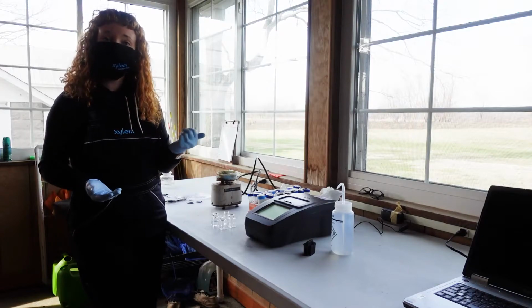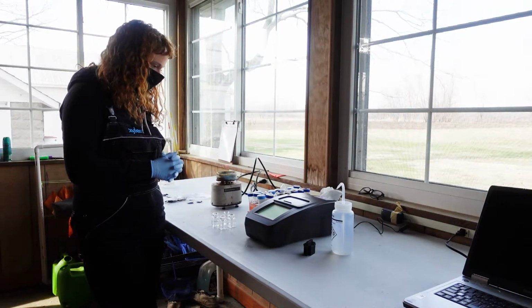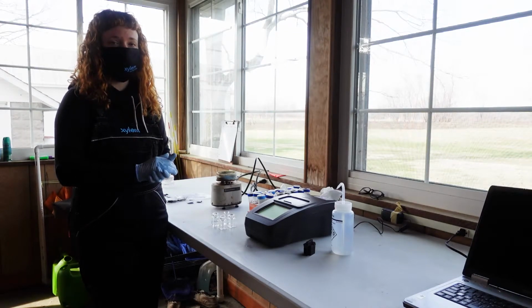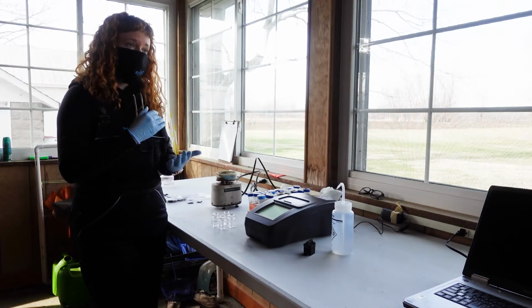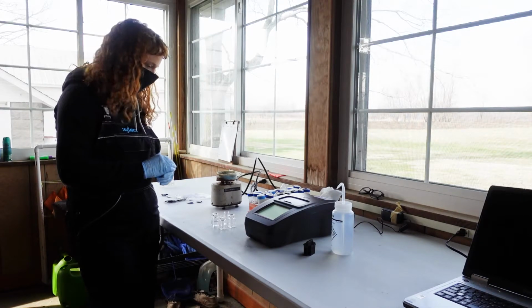All right, so I've zeroed my instrument. I've waited my 5 minutes. It's time to read some samples. The first thing I will do at the start of my sample set is run my standards. Remember those tubes that were labeled with N's? Those go first. You will also measure those halfway and at the end of your sampling for the day.